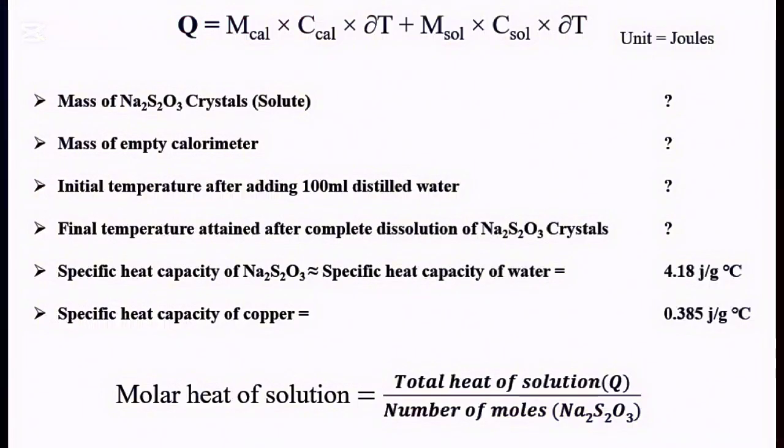Then multiply by the same temperature change. Then you find your heat of solution. Once you've solved arithmetically correctly, your units should be in joules.